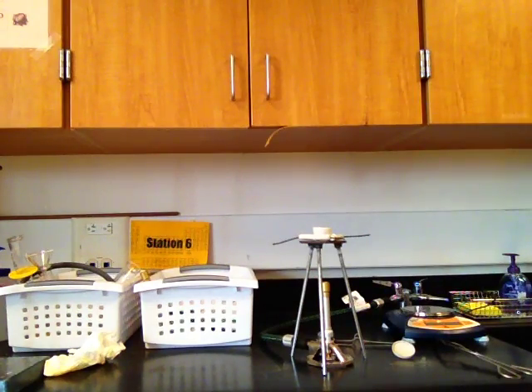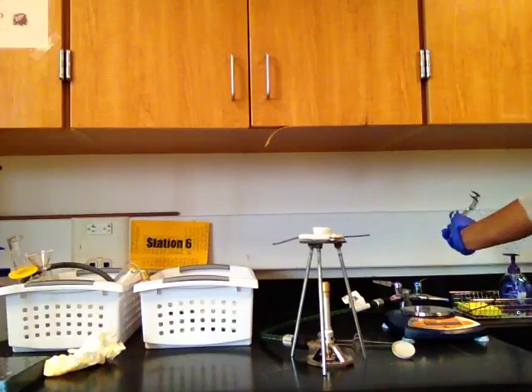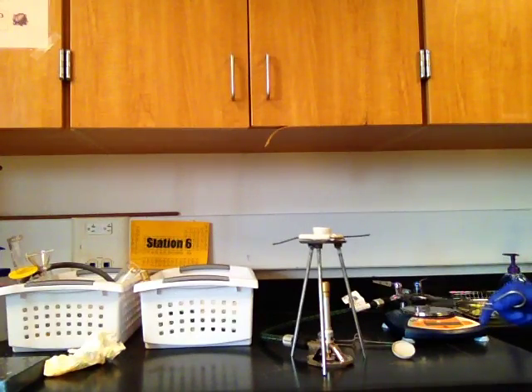Hello everybody. This lab is about finding the formula of a hydrate. For that, you will be given an unknown sample of hydrate and your task is to figure out how many water molecules are attached per mole of the hydrate. And for doing that, what you need is a setup like that.